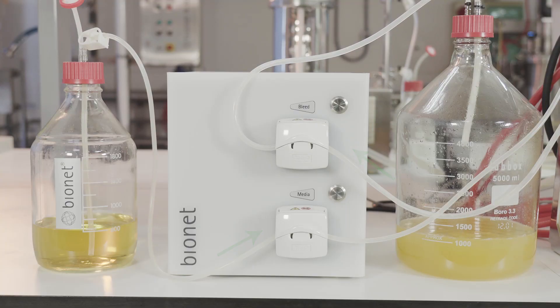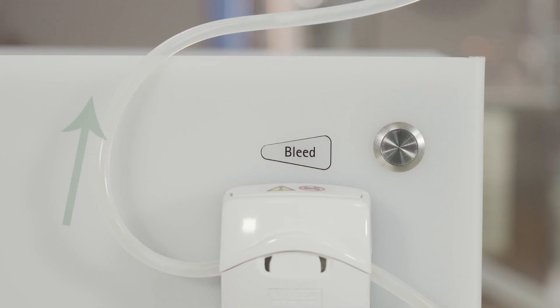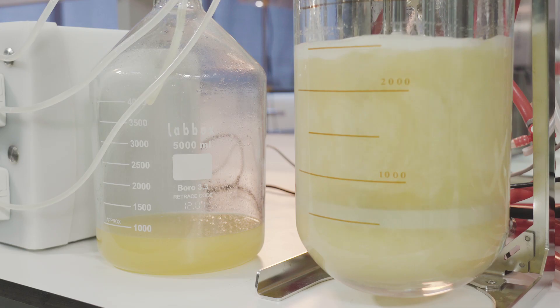This will determine the addition flow and thereby also the withdrawal rate, which are equal. Therefore, the volume of the culture broth is kept constant, in this case, at 2.5 liters.